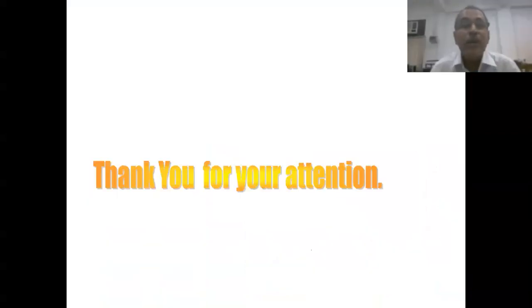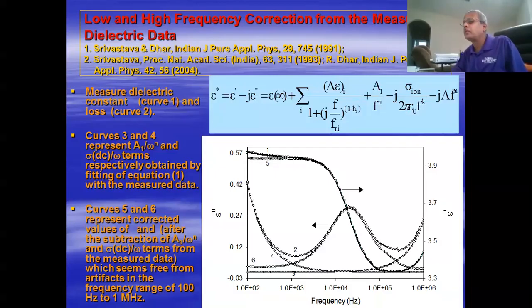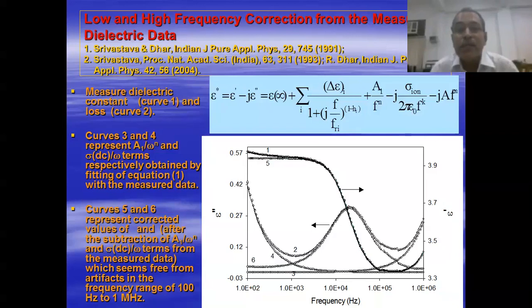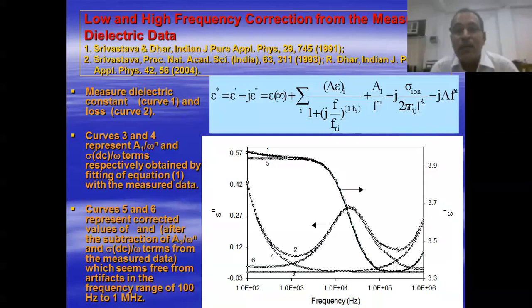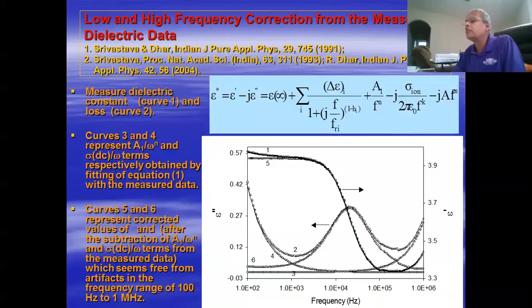Okay. So it is important that whether it is DSC or in dielectric spectroscopy, in both the cases, you will have to remove the artifacts. You must have the proper experience to analyze them, to remove those artifacts to get the real property of your material. So, in fact, all these techniques need 1 or 2 hours to discuss, and it is very quickly discussed. I don't know how much you have been able to grasp it, but okay, these are the things, and thank you very much.